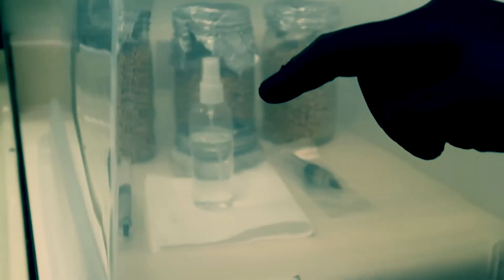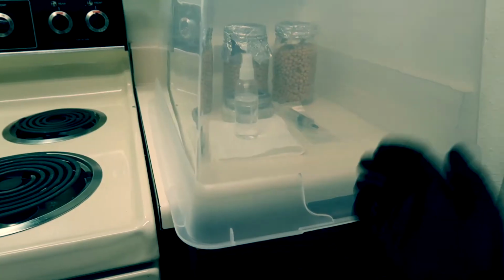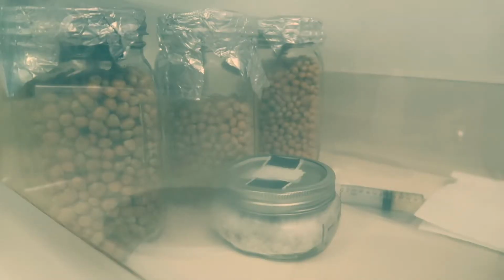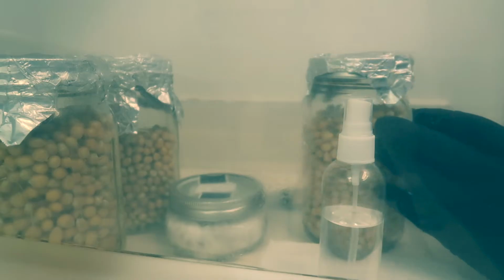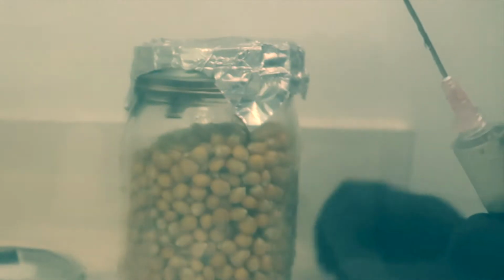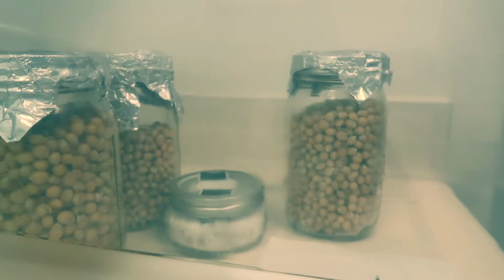I will be using my unmodified still air box here for this. If you don't know what this is, it's just an unmodified 58 quart tote that I flip over onto my counter, and then I hang it over the edge just a little bit, and then I position myself below it so I can work up inside of it just like this. Get a nice spray down of some isopropyl alcohol. I'll do my liquid culture syringe inoculation first here, and because this is a used needle, I'm going to flame sterilize it outside of my still air box. I'm going to remove the dust cover first so I can work with the lid easier here.